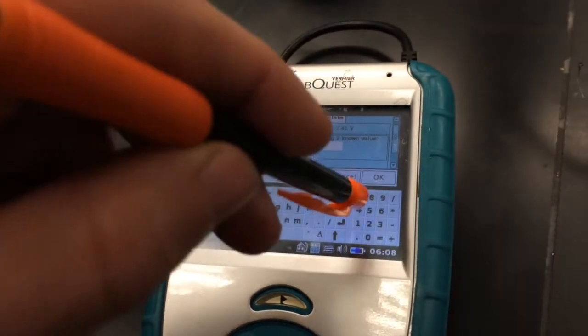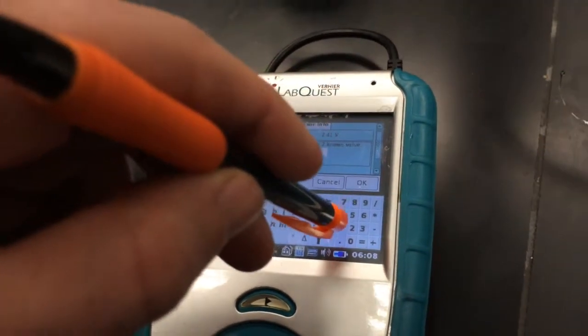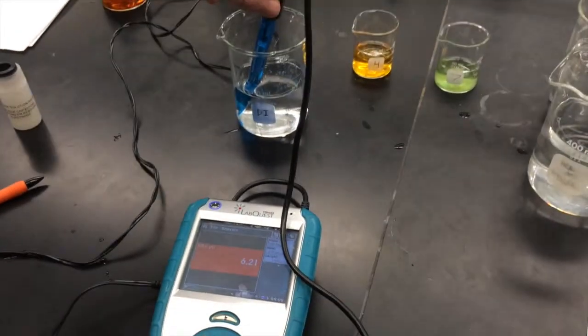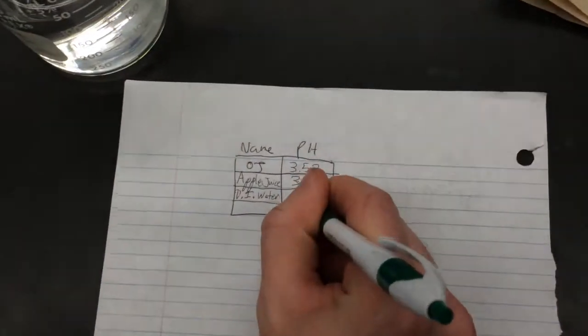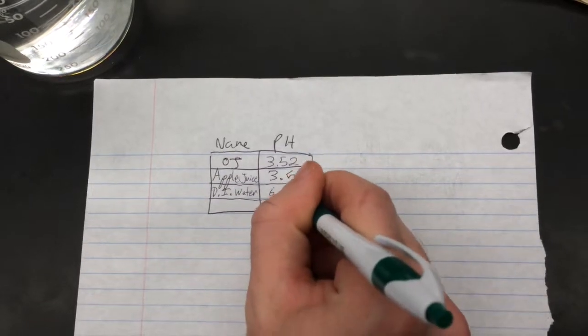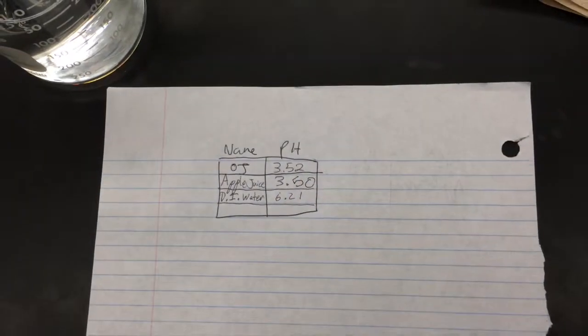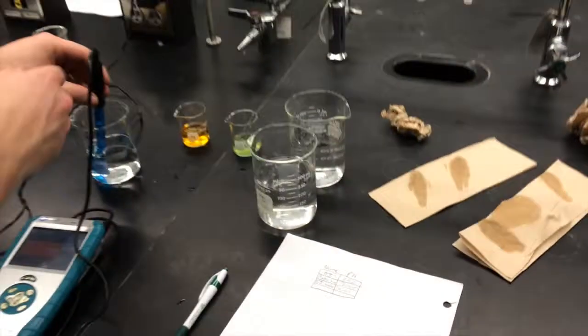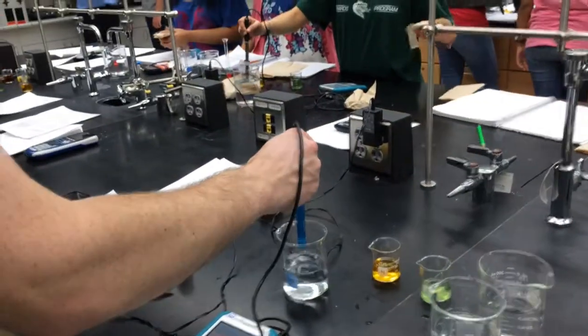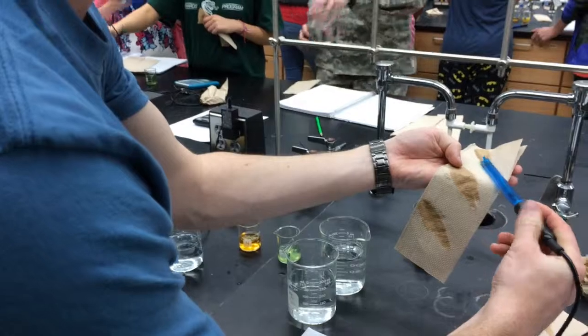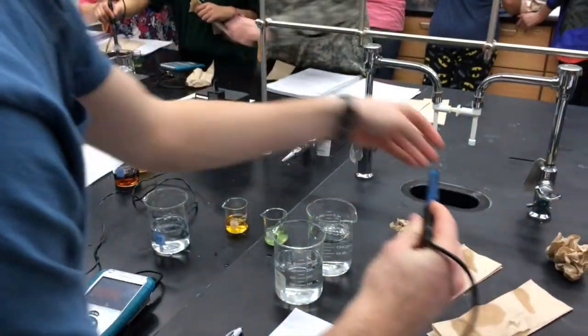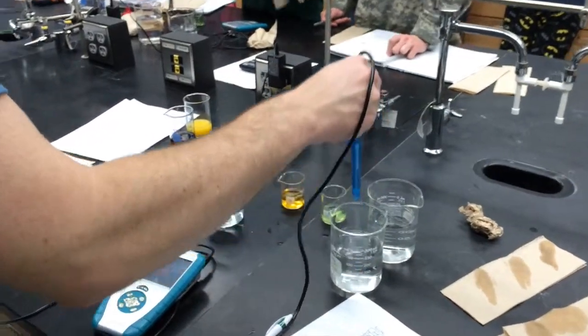Now the pH meter is calibrated to test for his solution. Patton obtains the pH for deionized water, which comes out to 6.21. Now that Patton is done testing for his solution, he cleans the probe and prepares it for storage.